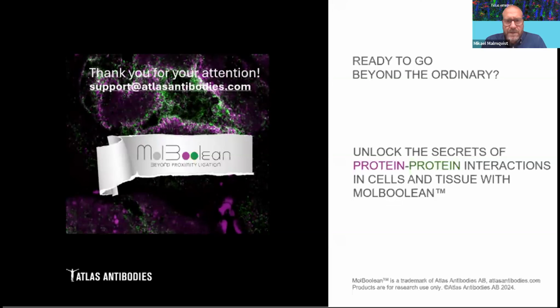Okay, I think this is a very interesting question. Is there any data available about how often a protein-protein interaction may obscure an antibody epitope? I'm wondering if protein visibility may be reduced if the epitope is obscured during the protein-protein interaction. Absolutely, and I think we have seen that. We haven't investigated thoroughly, but we have used antibodies that don't work for monitoring protein interactions.